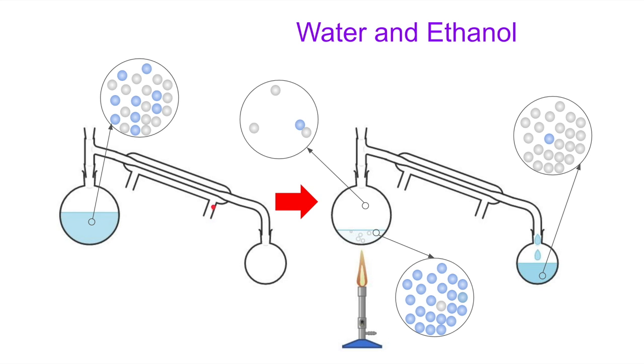So in the bottom opening, you allow some cold water to go through, and then the cold water goes out the top opening. So that makes this section of the inside tube cold because it's in contact with that cold water on the outside. So the gas, when it goes through that cold zone, condenses and turns back into a liquid. And then that liquid drips around this pipe into this lower flask down here.